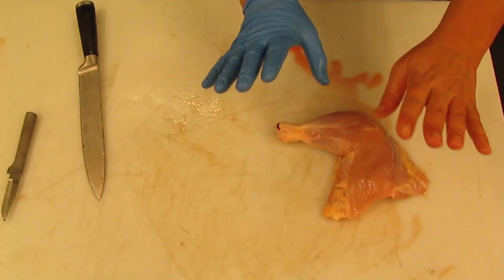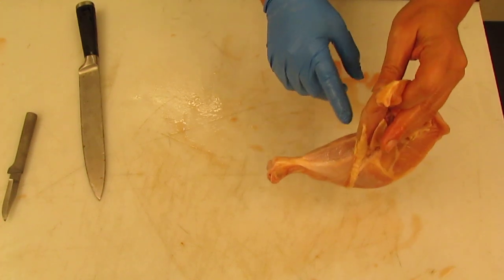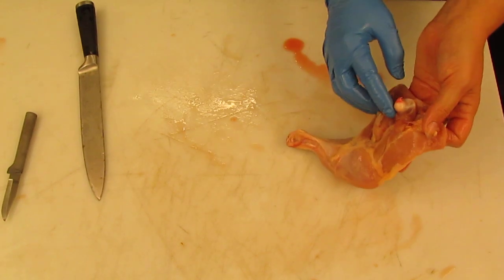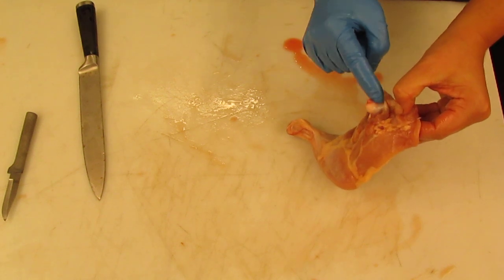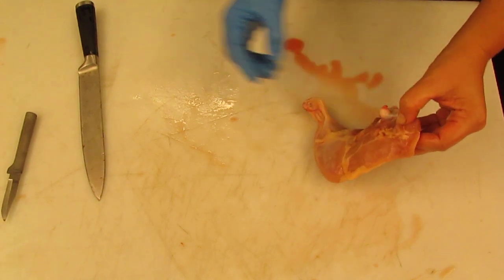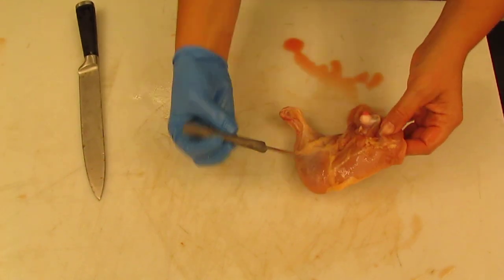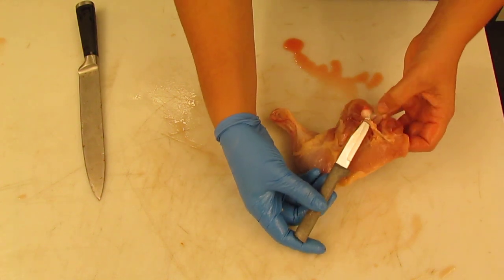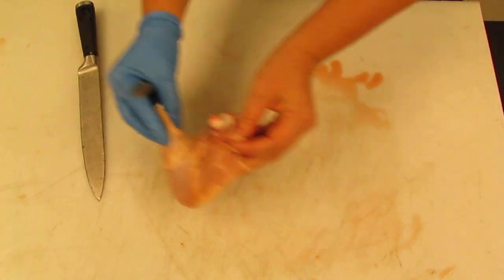All right, next, let's explore these joints a little bit. Okay, if we look up here by the hip, we can see the nice smooth ball of the ball and socket joint of the hip, and also, we can see a lot of like stringy stuff. And so what is that all about here? Show that view and I will show you guys as well.